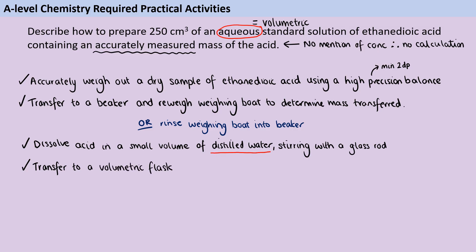Then we're going to transfer that to a volumetric flask. Now it's important that you know this word volumetric. Obviously it's important that you can name all of your equipment. But when this question came up in 2016, you couldn't get into level three if you hadn't talked about a volumetric flask. So remember that word. And we're also going to make sure that we rinse all the equipment. So the glass stirring rod and the beaker and a funnel if you used it, and all of the rinsings go into that volumetric flask. So every last little bit of this compound that you've weighed out ends up inside that volumetric flask being part of the standard solution.